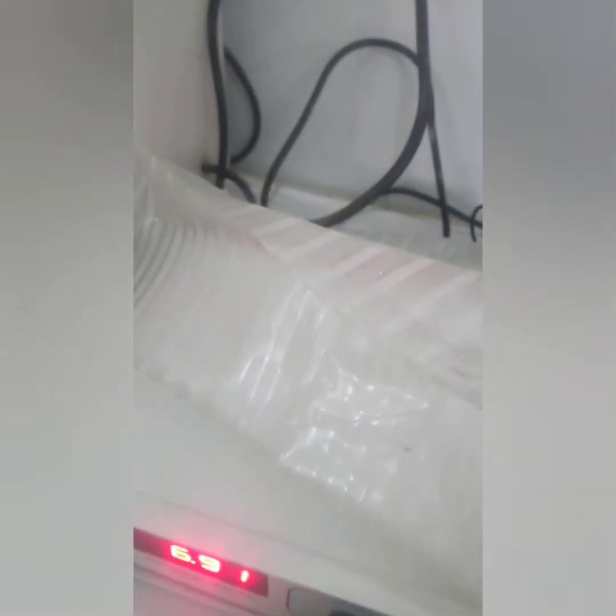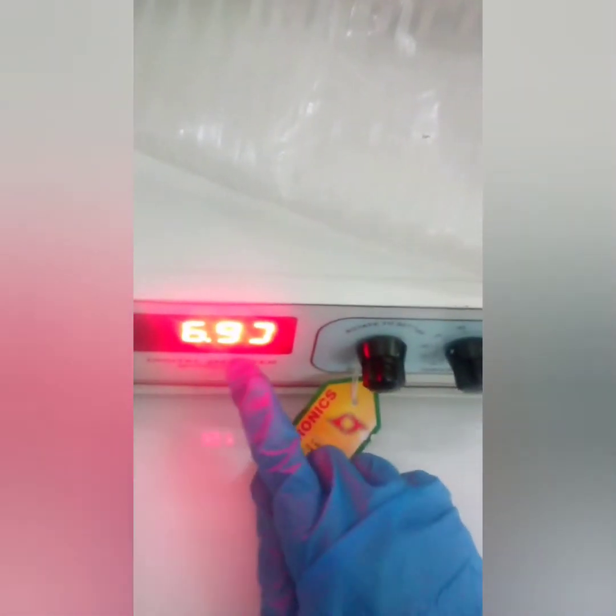First, let us just see what the pH of the buffer is. For measuring the pH of the buffer, you see here it's 6.9.